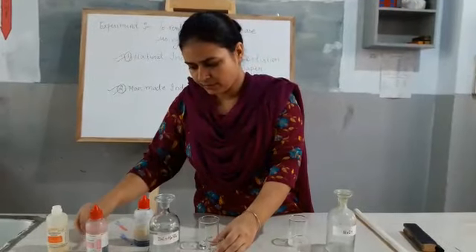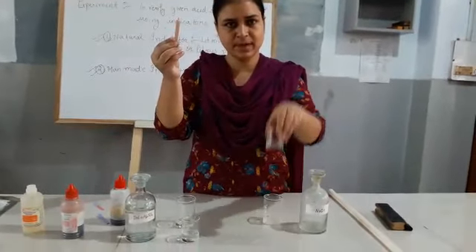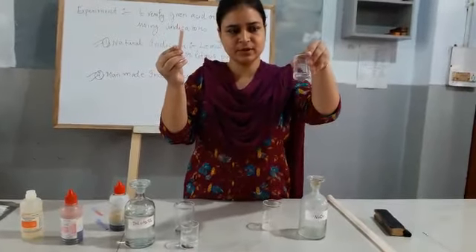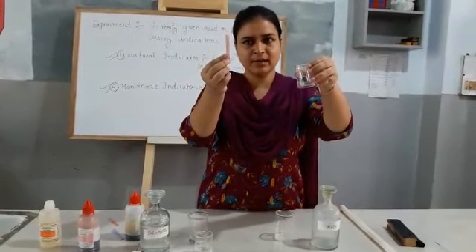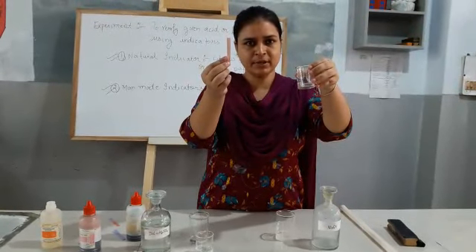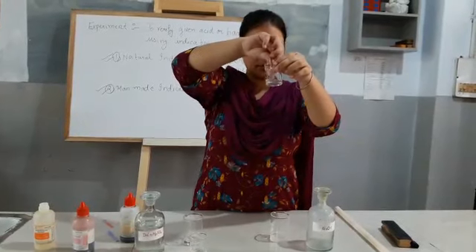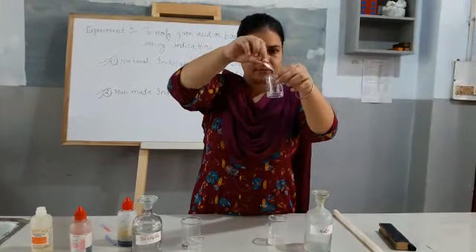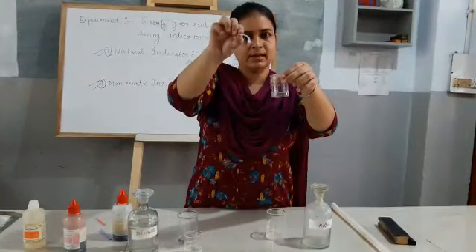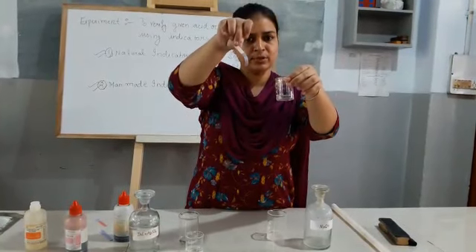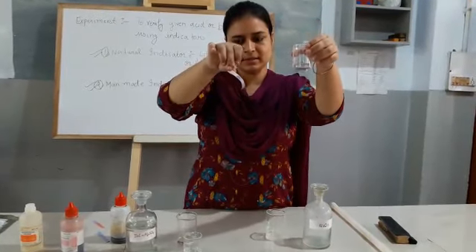Now, let us try it out with red litmus paper. As you know, this is the base — that is our sodium hydroxide. Base turns red litmus paper to blue. Let us check it out. See, the red litmus paper changes to blue. This verifies that this beaker contains a base.